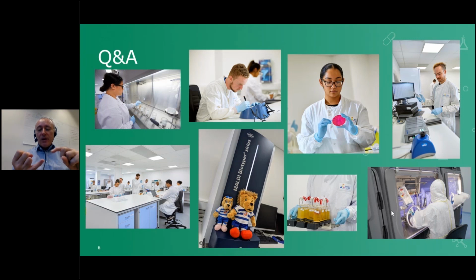So a risk-based, thoughtful approach to environmental monitoring, for example, would seem important. A risk-based approach to assessing raw material suppliers and the degree of testing and which microorganisms are appropriate to test for, a sound sampling plan for a water system. So there's quite a lot in there that you can draw upon that can give you pointers without necessarily having to worry about covering everything in terms of an audit. So yeah, there's lots. If you're working in non-steriles, it's worth reading Annex 1 and jotting a few points down that you can then take back into the different environment.